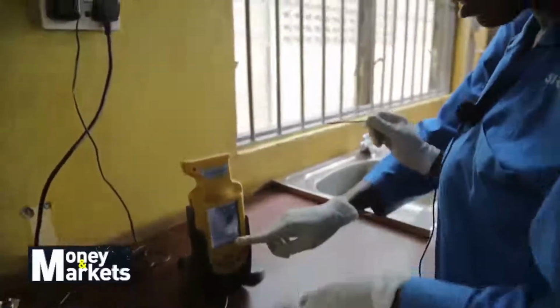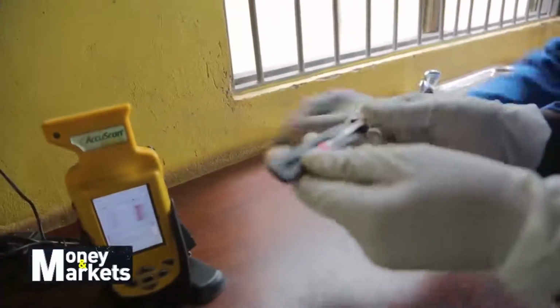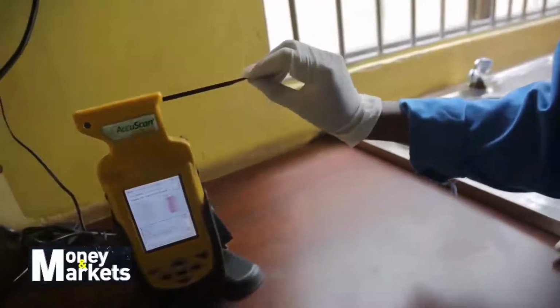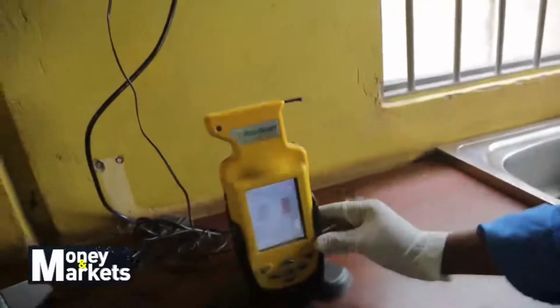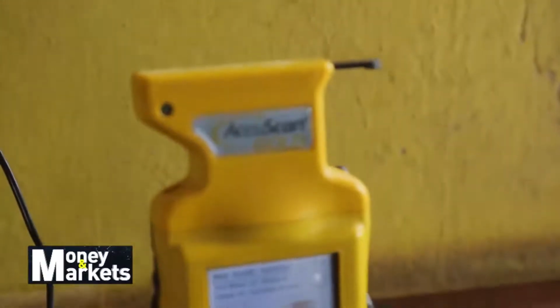After the 6 minutes, you get your strip and put it here. It's a very, very fast experiment. You have to be very fast. And then put it in your AccuScan Gold. And then you get 2.9 ppb.